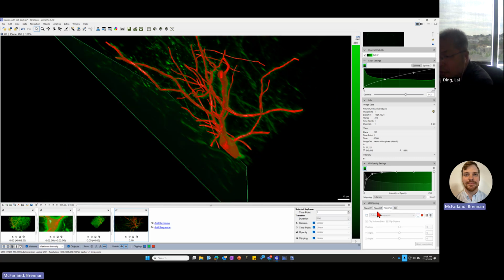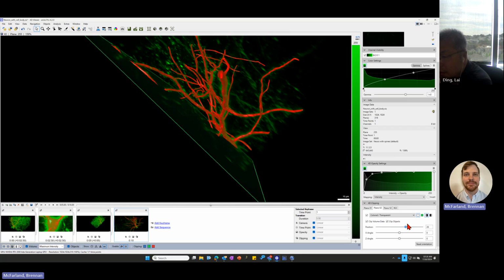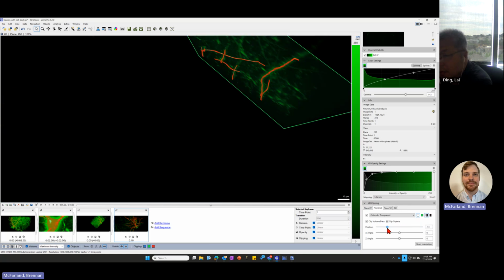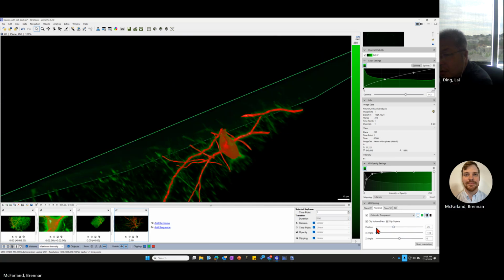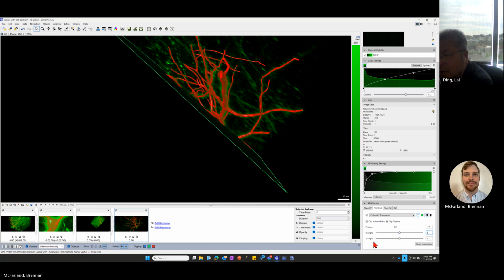You can stack them. But you can see right here, it's clipping everything, right? So as I move my slider, it's choosing what to take and what to move away. We can also change this angle, but for now, I'll set it to 0. And we also have the option here to change the border of this clipping plane right here. Right now, it's set to green. A little bit of tweaking that you can also do.